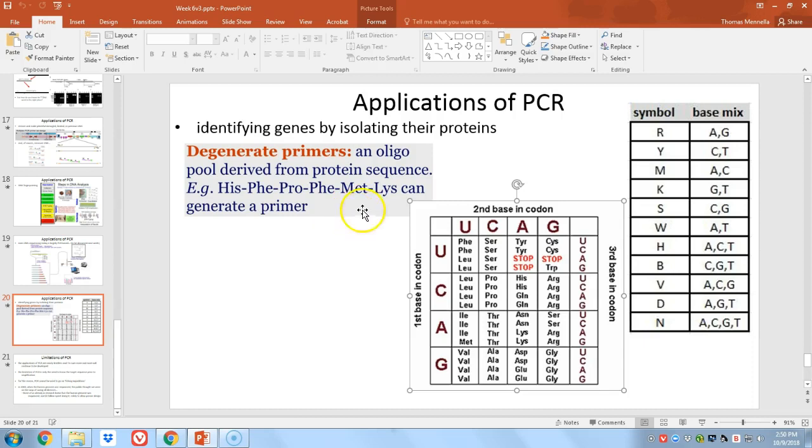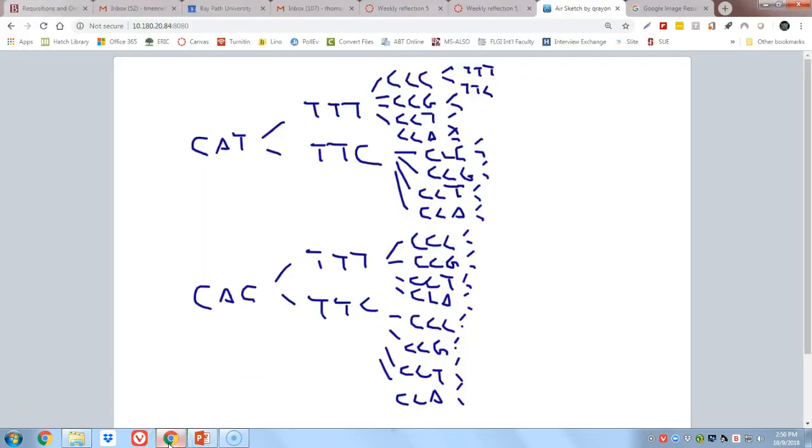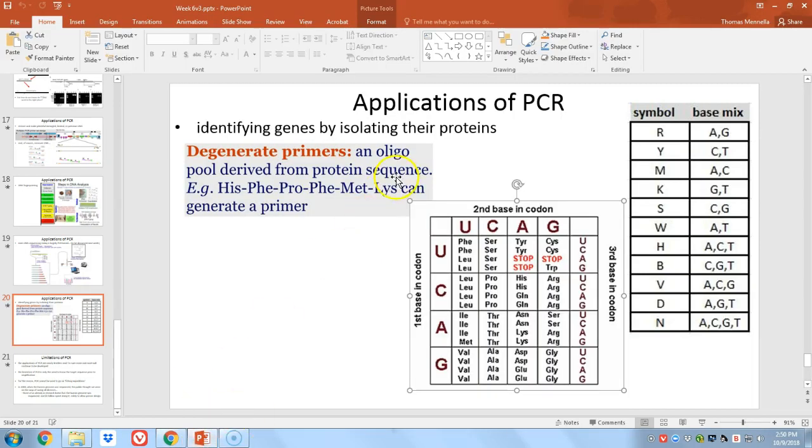Ooh, when we see a methionine, we get happy because there's only one codon for methionine, ATG. So that means for each of our 32, we just have to put an ATG after it. And then we're near the end of our sequence, and we have a lysine. Lysine can be encoded by 2 different codons.